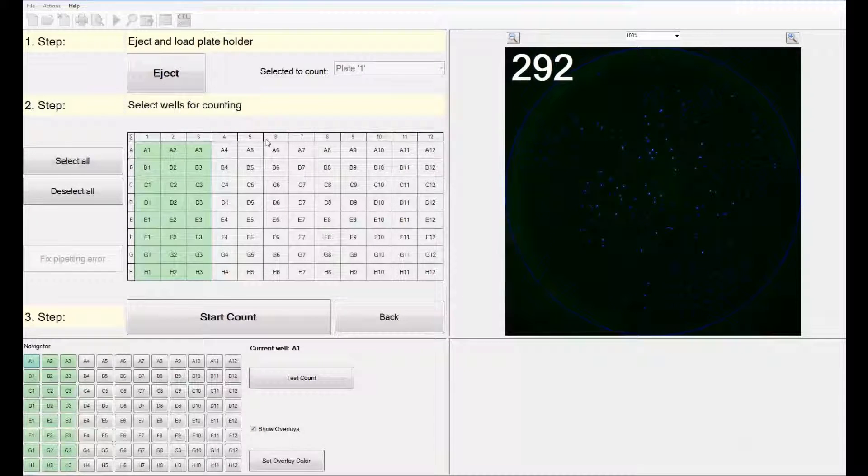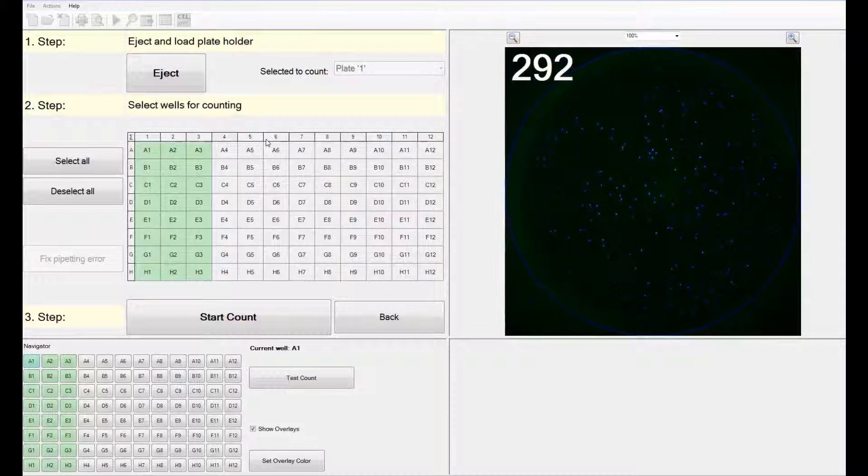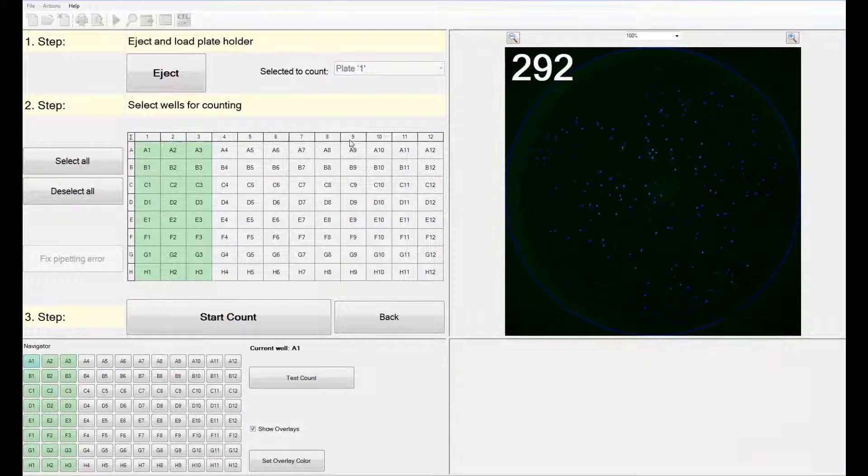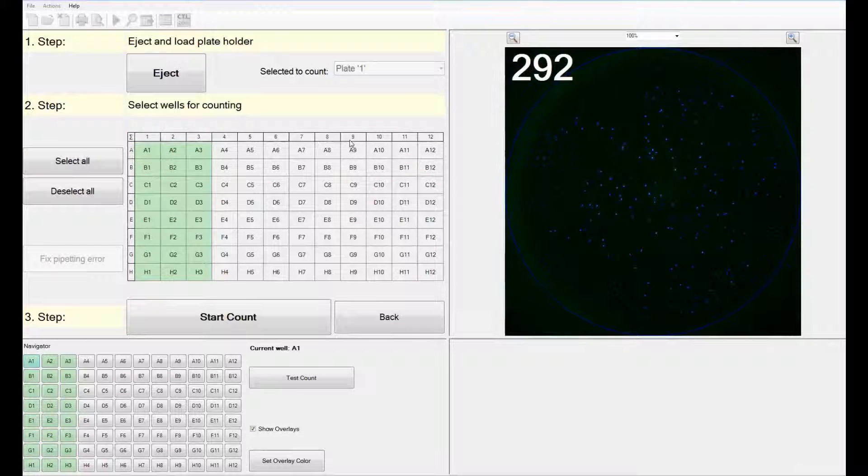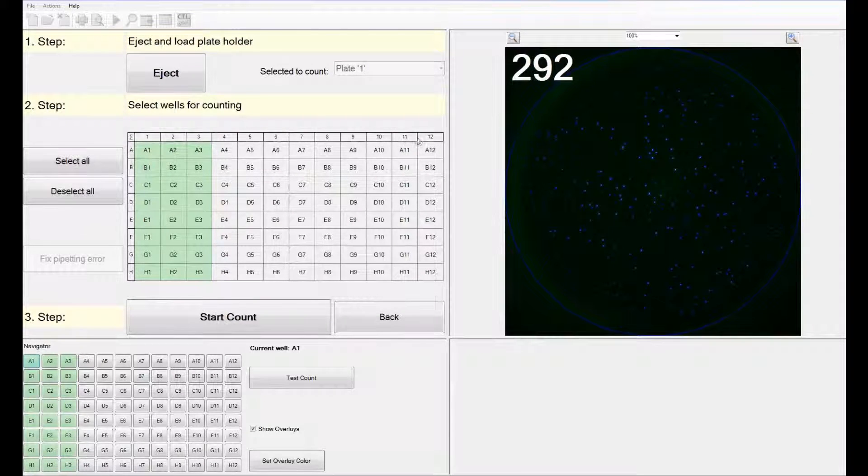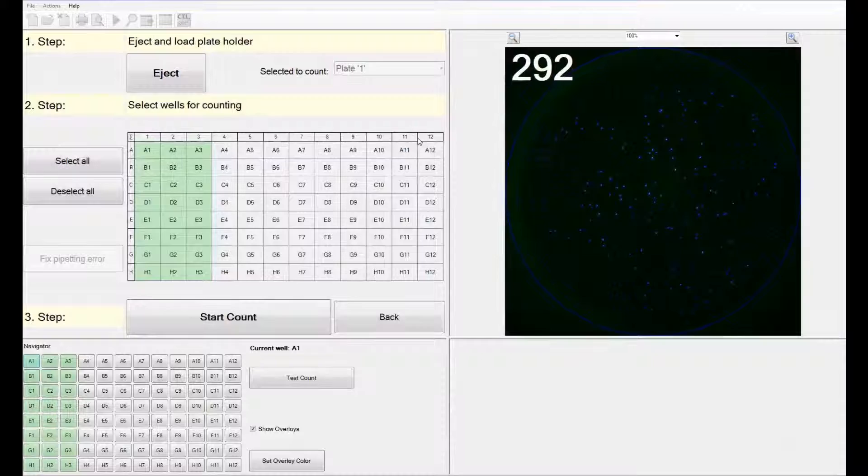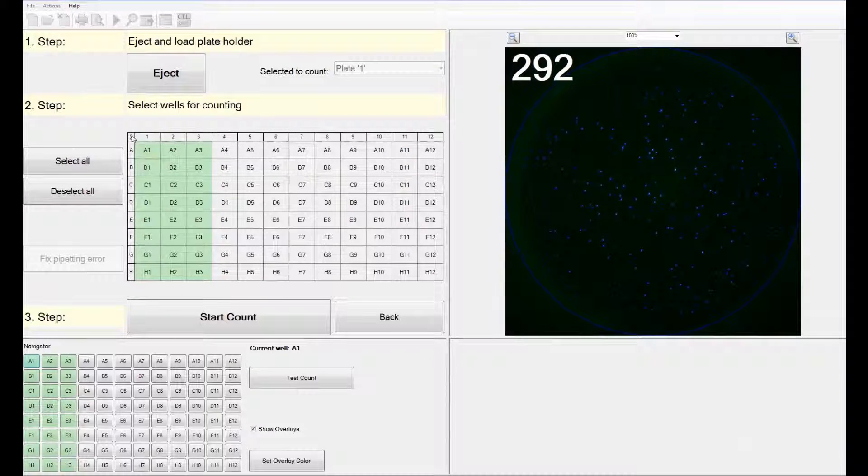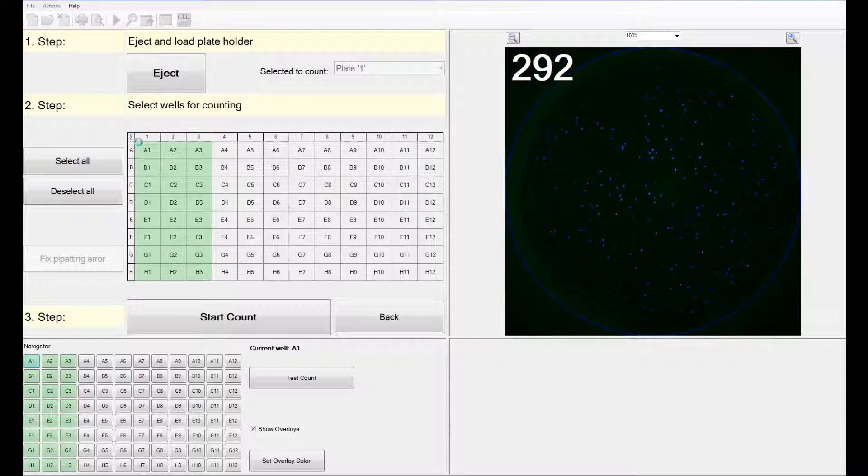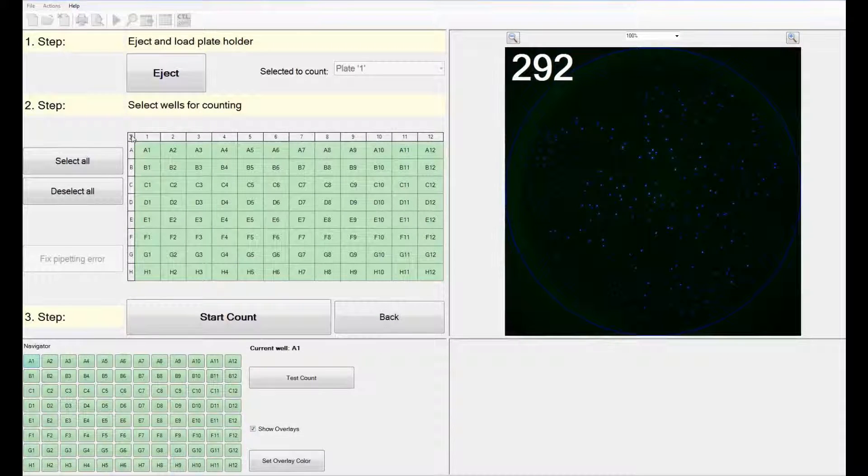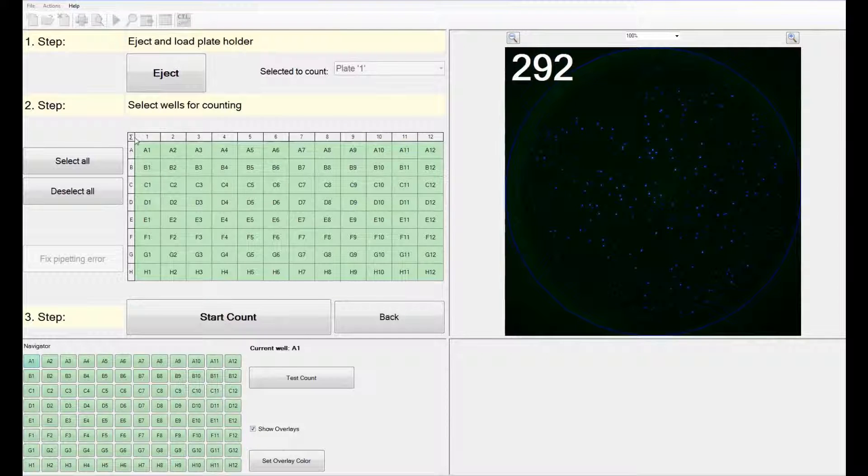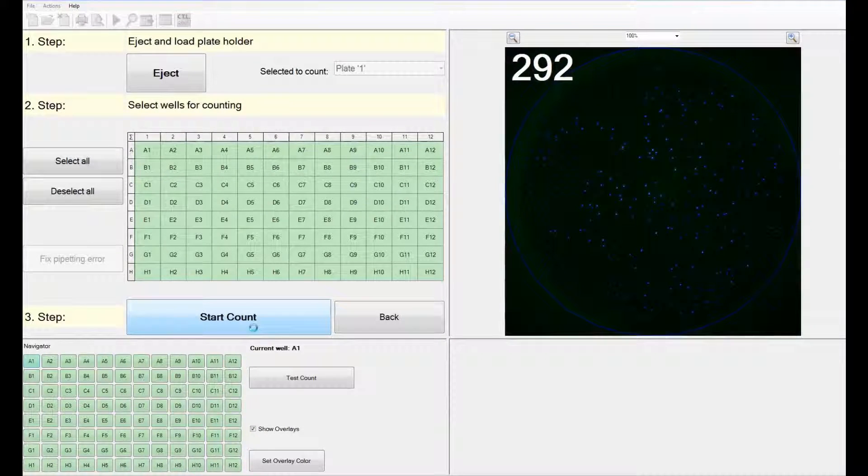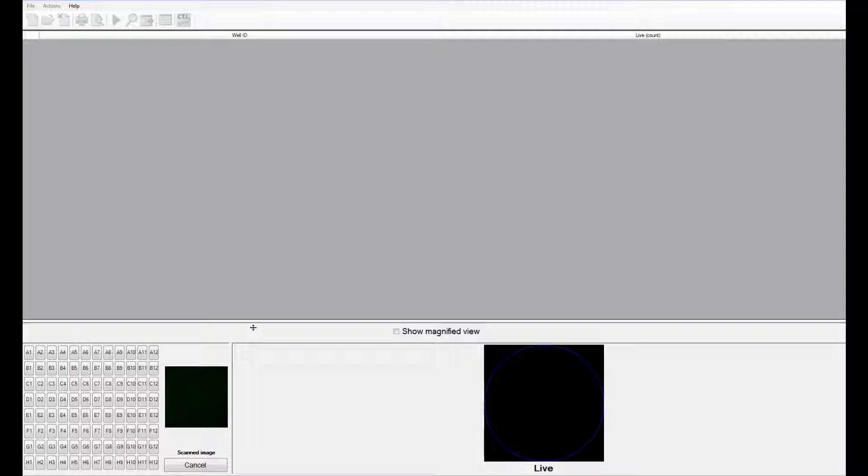Columns 7, 8, and 9 represent donor number 3, and 10, 11, and 12 represent the 4th donor. At this point, I am going to select all the wells in my plate. You then say start count to get started.